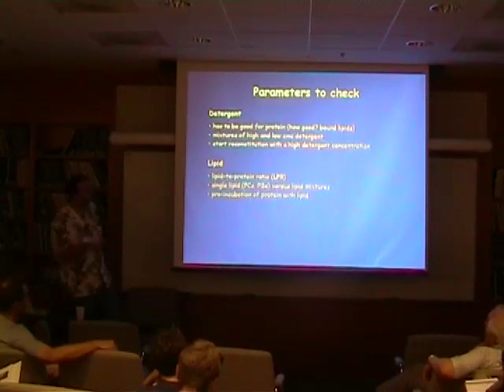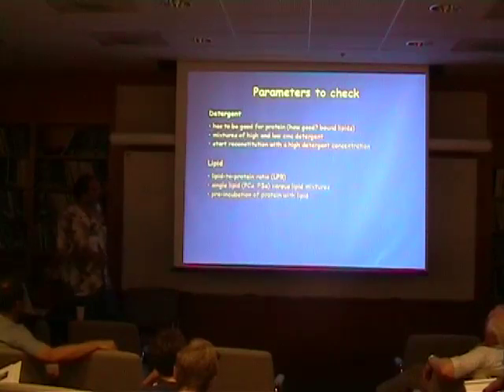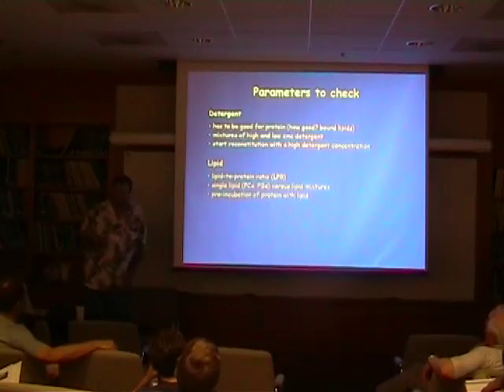The idea with single lipid is we want to start with a very simple system, which is very controllable. The advantage of lipid mixture is that the protein can actually choose the lipid it likes. So again, these are just different philosophies. And then again, this is an example of something I really don't believe in.